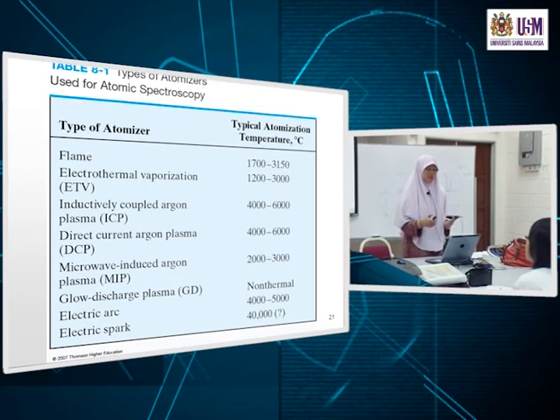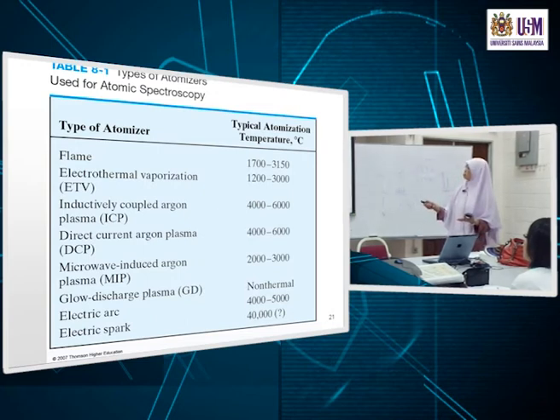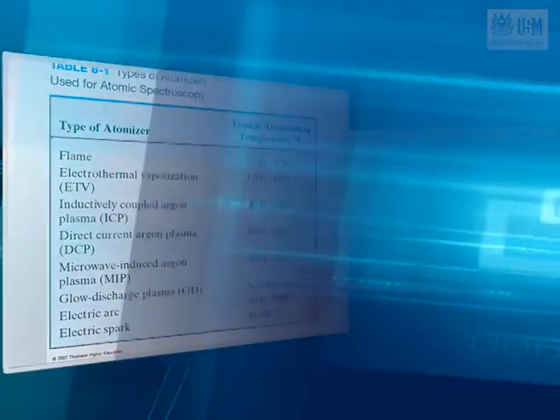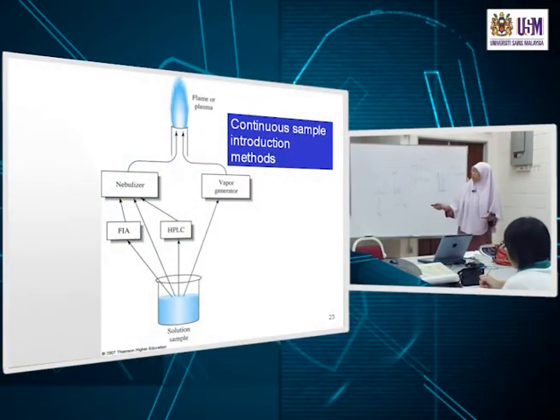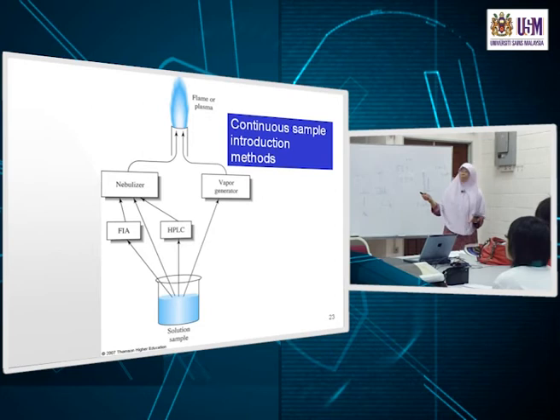And when we talk about sample introduction, how we want to introduce our sample into the system, you talk about different kinds of nebulization or hydride generation and whatnot. The simplest that we will look at is the process: you have your sample of interest in solution. Sodium ions floating around in that beaker of solution. But we want it to form sodium atoms here in the flame. So the process from the solution to the flame usually involves some nebulizer.